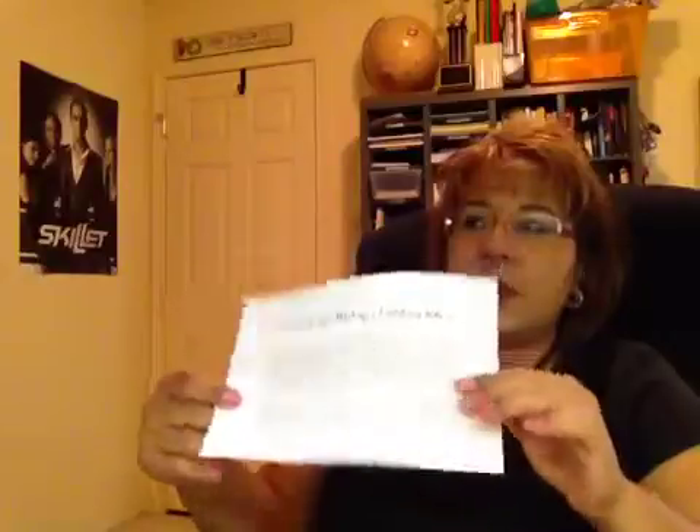You're also going to see on top of your lab pack box a white half sheet of paper that says at the top in big letters: notice for biology lab pack BK1, which is the name of your kit — biology kit number one. The notice is telling you that there are some test tubes inside of your kit that need to be refrigerated upon receipt of your kit. So I'm going to open the kit and show you what they're talking about.